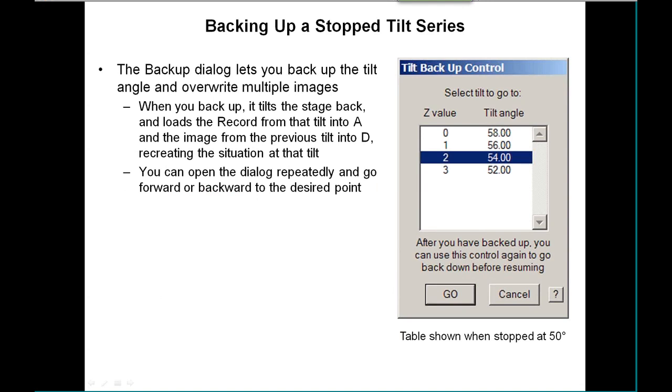Backing up is useful if you leave the room, come back, and see that it screwed up five tilts ago. You can open up this dialog and dial up any previous tilt that's listed here. Push the button and it will reload the record image from that tilt and reload the image from the previous tilt into buffer D, so it's ready for alignment. This basically recreates the situation that was present at that tilt, and you can actually go back and forth.